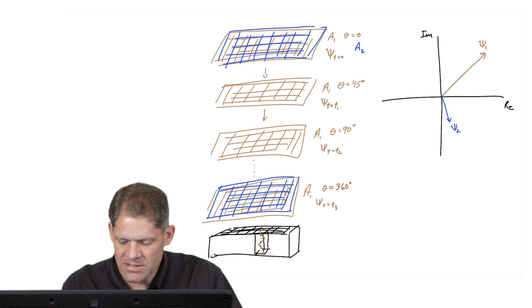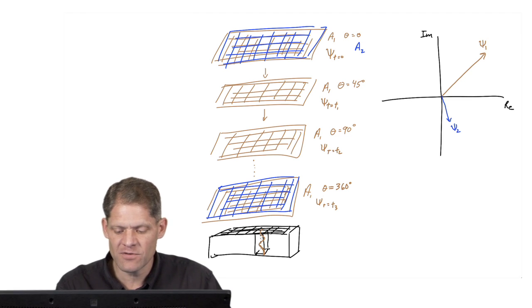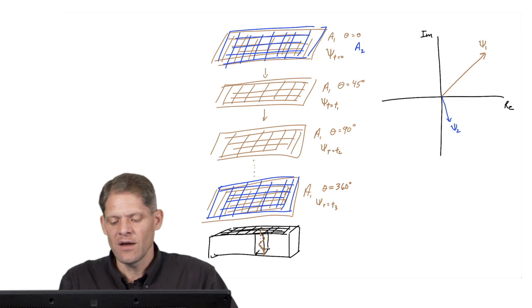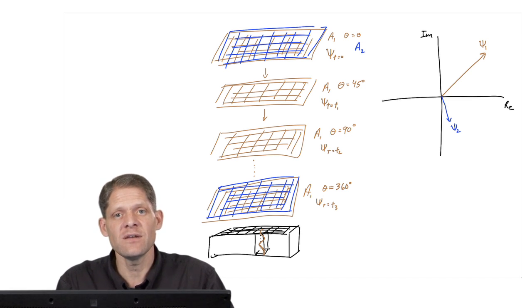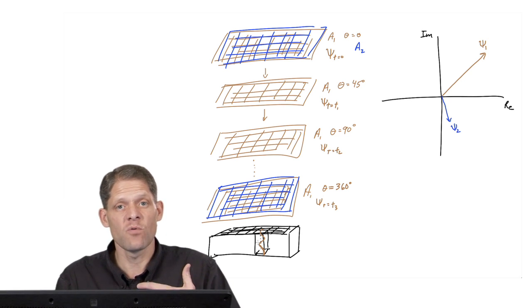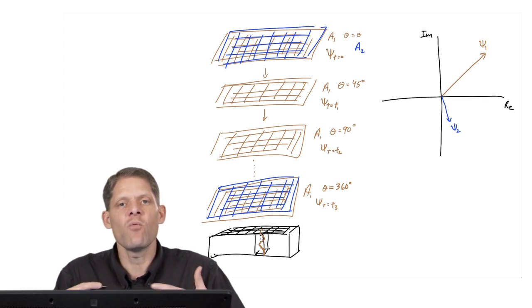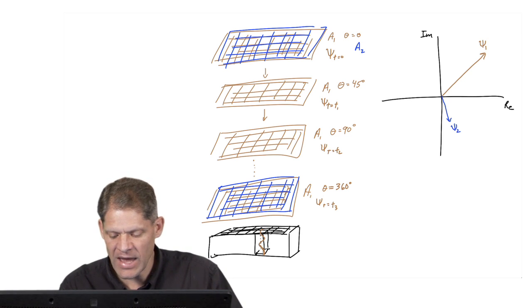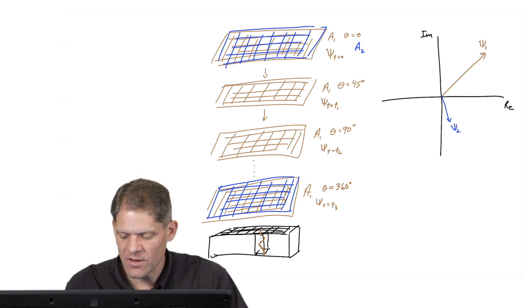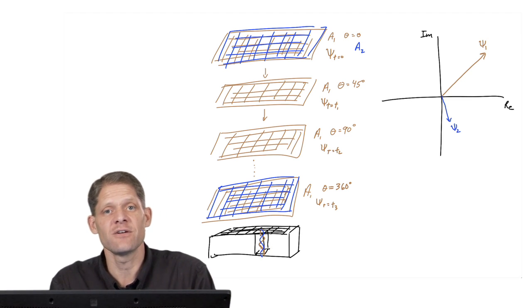Now here I've drawn it oscillating, not that any part of the wave or anything about the wave is moving to the left or to the right. I've just drawn it wavy to help represent the fact that its phase is advancing from 0 to 360 and around the circle. And it has a particular wavelength, and so that's represented by the wavelength here. And so whatever that wave is oscillating within that pixel of the detector. Now alongside it, the other wave is also oscillating alongside it, and these waves add together in space.